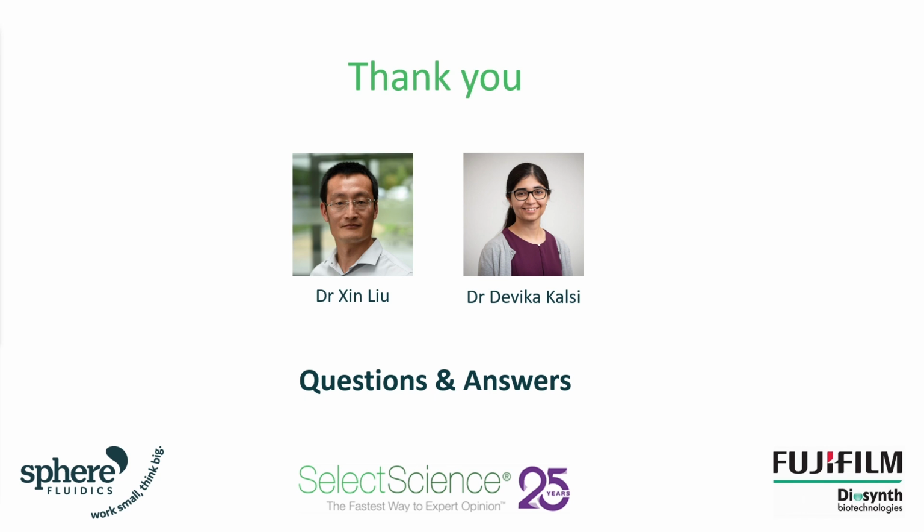Thank you. And one final question. Why has Apollo not made use of targeted integration, i.e. CRISPR-Cas9? Wouldn't this give greater speed and control? That is a good question. With CRISPR-Cas9 targeted integration, you're targeting specific sites or specific pathways. And with directed evolution, it may not be the most sophisticated technology out there, but it gives us a bigger benefit when we've compared against targeted integration in terms of getting a larger improvement in growth and titer.